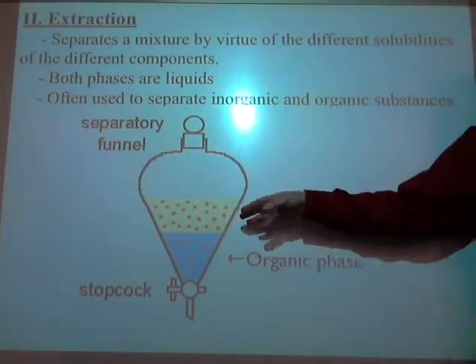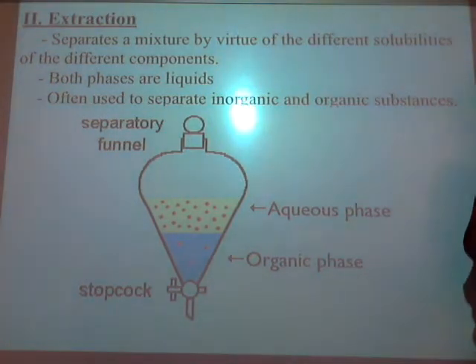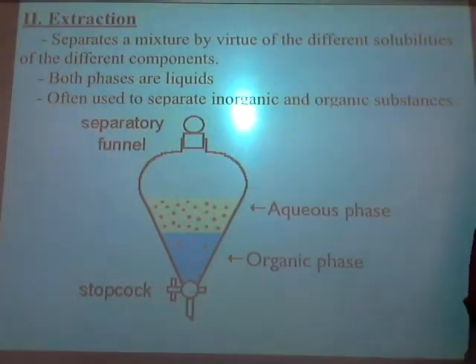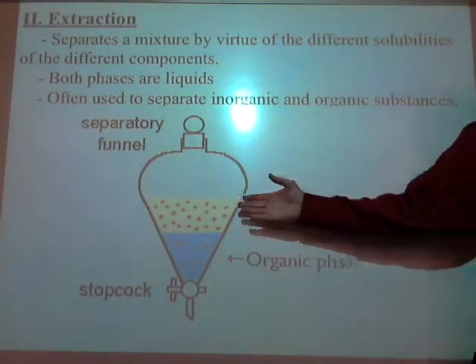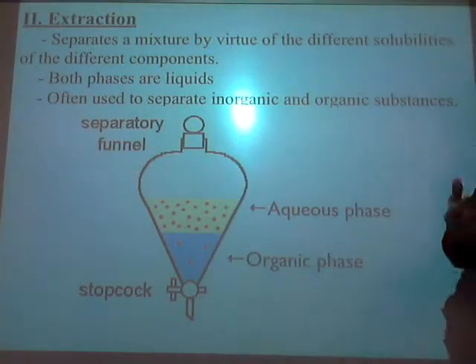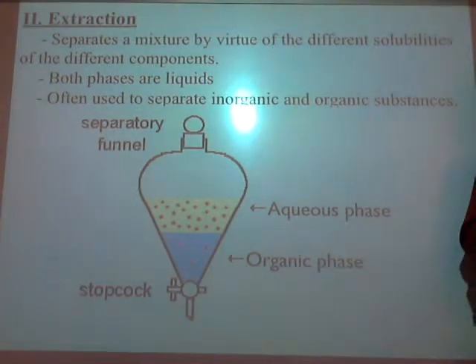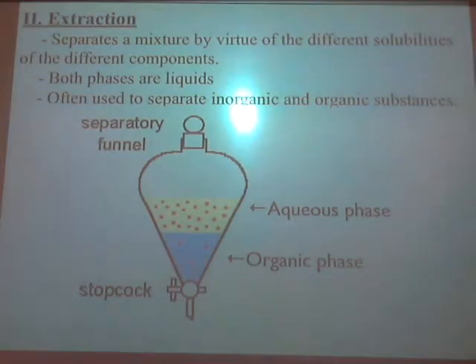Usually if you see a separation like that, for example in a vinegar and oil salad dressing, what's on the top? I got you. Oil floats, right? So the oil will be on the top and the water's on the bottom. Water's more dense than oil. But chloroform is unusually dense, and basically it will sink to the bottom, and that's where you're going to find it. Matter of fact, that's what this looks like right here.